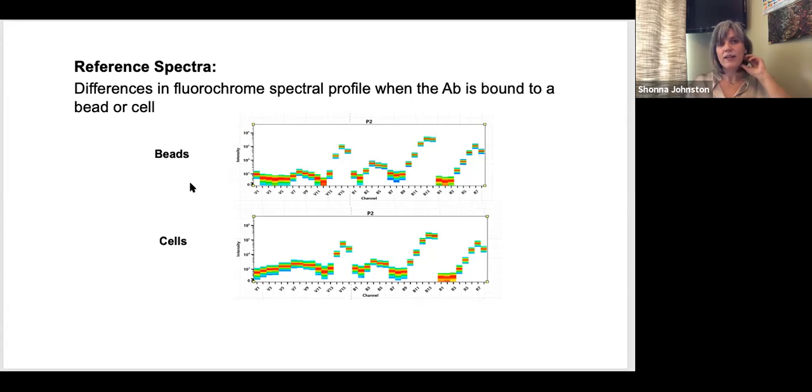As I said, I quite like using the beads for normal filter-based systems, but we were a little bit concerned that that might be something that would have an impact. I haven't seen a massive amount of difference with quite a few of the fluorochromes that I've been working with, but I haven't done a huge test. A lot of these things have been put paid to by the lockdown. We were just getting into quite a nice program of testing and then it all sort of got stopped short.